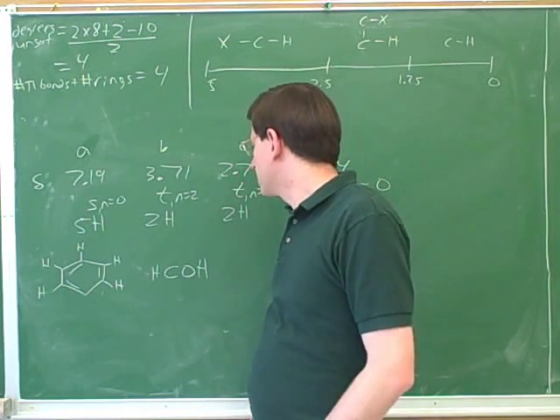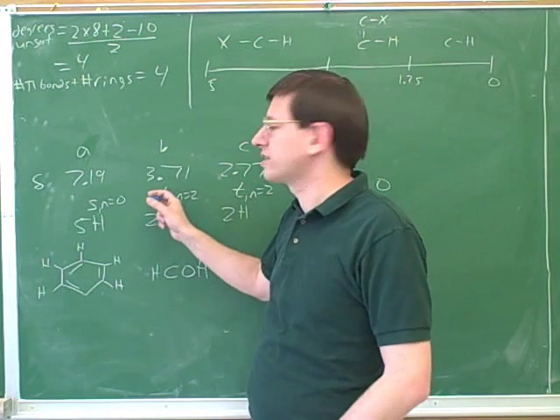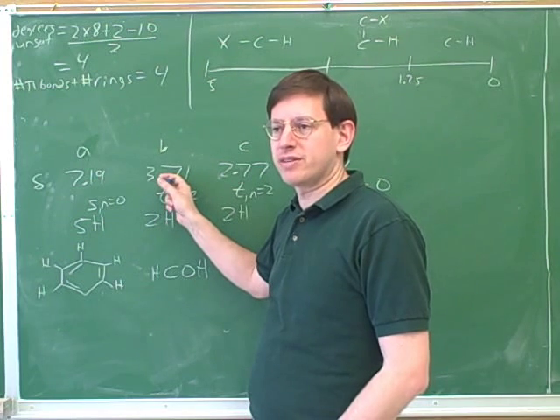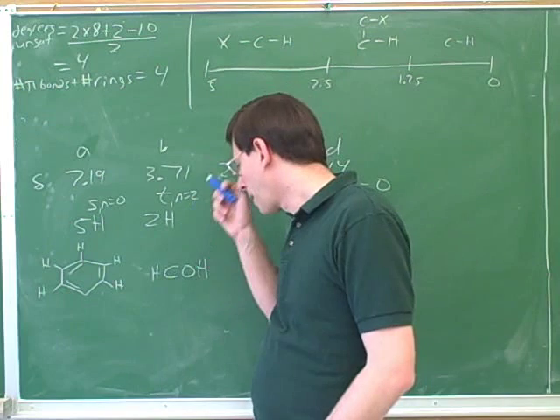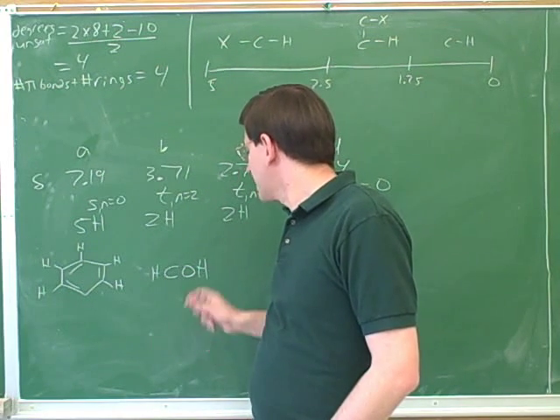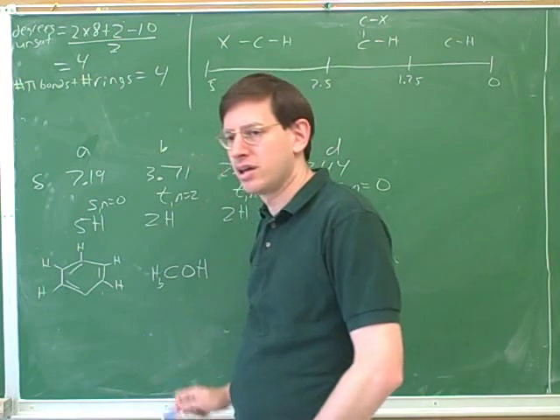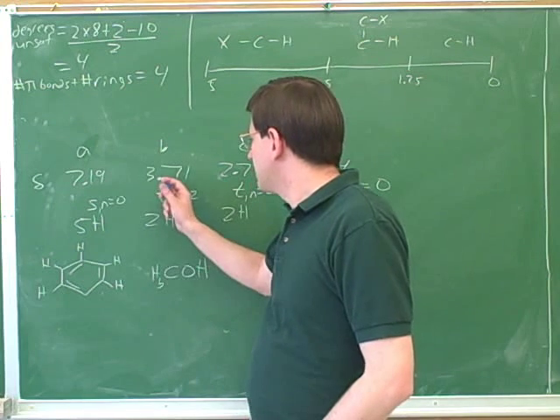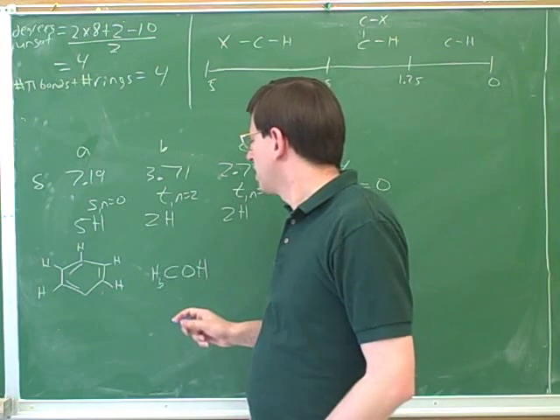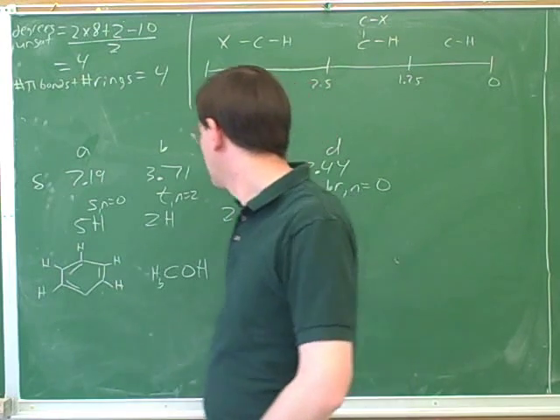Looking at this over here, you were saying, gee, it looks like these hydrogens are on a carbon that's connected to the oxygen because they're pulled so far to the left. I think that's what you were thinking. So here's the oxygen and here's the carbon. But you weren't saying this was the group B hydrogen, right? You were saying this was the group B hydrogen. I haven't labeled either of them yet. Right, but you were thinking that this absorption came... I think it's more consistent with being on an alcohol. Oh, okay.